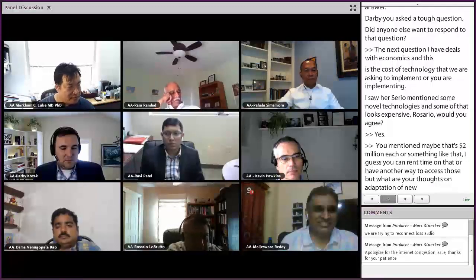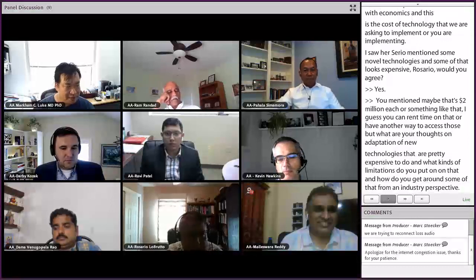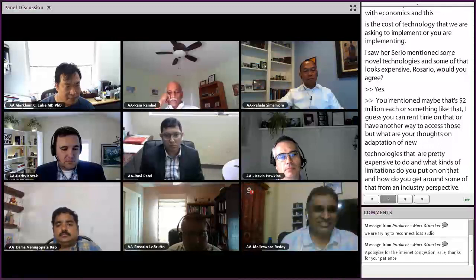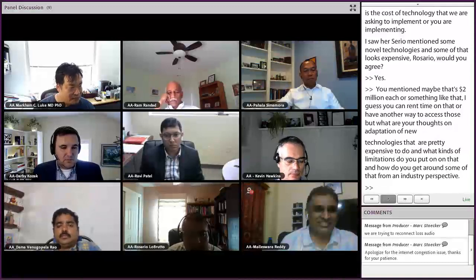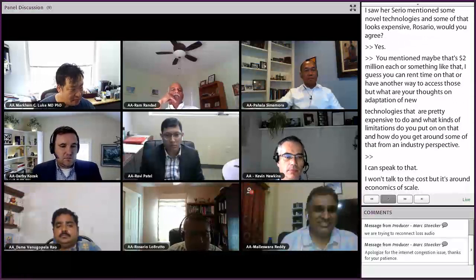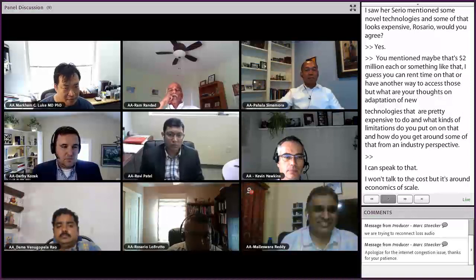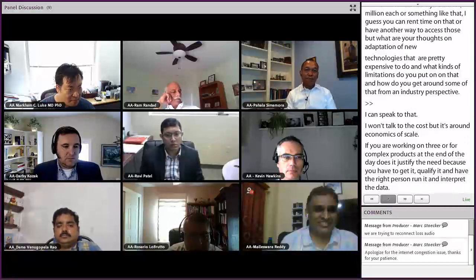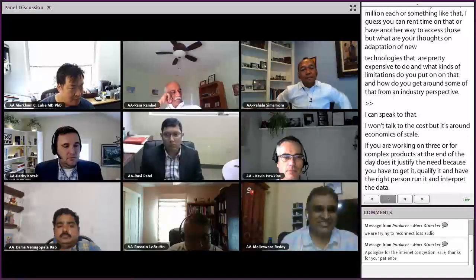Right. I can speak to that. I'm not going to speak to the specifics of the cost of instruments, but it's really around economies of scale. If you're working on 3 or 4 complex products, at the end of the day, does it justify purchasing the instrument? Because then you have to get it, qualify it, and have the right person to run it and interpret the data. Or do you interface with a qualified CRO to get your analysis done? So it's a balancing act at the end of the day.